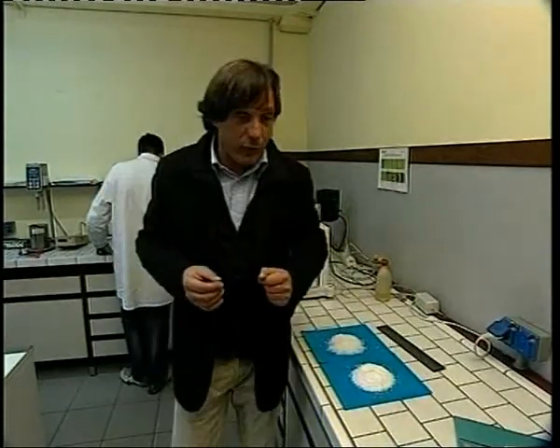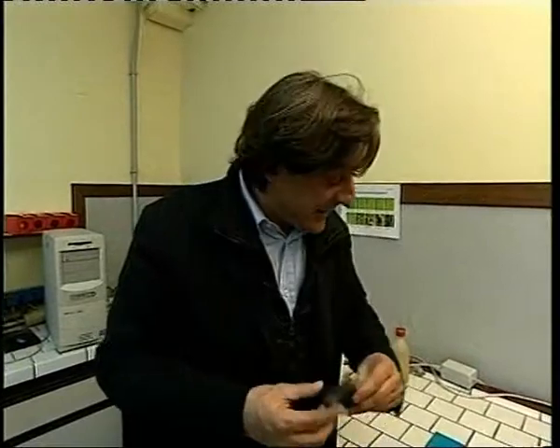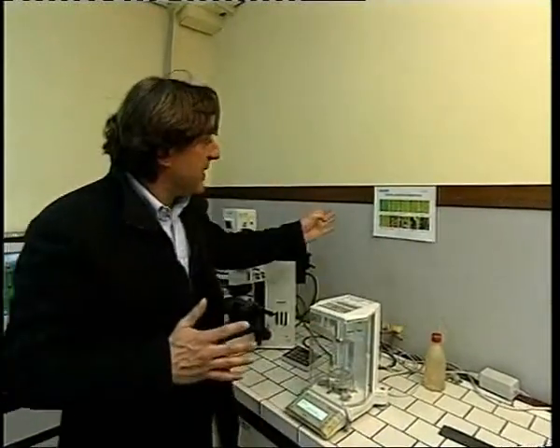It's also true that in order to maintain constancy in production, the selection of the raw materials inside a laboratory like this one is a fundamental step in maintaining the quality of the product. These modifying resins are responsible for the duration and chemical physical performance of the membrane. But it's also important to understand how the resins work and how they are amalgamated into the bituminous mixture. These photos illustrate the dispersion of the resin inside the bituminous mixture.